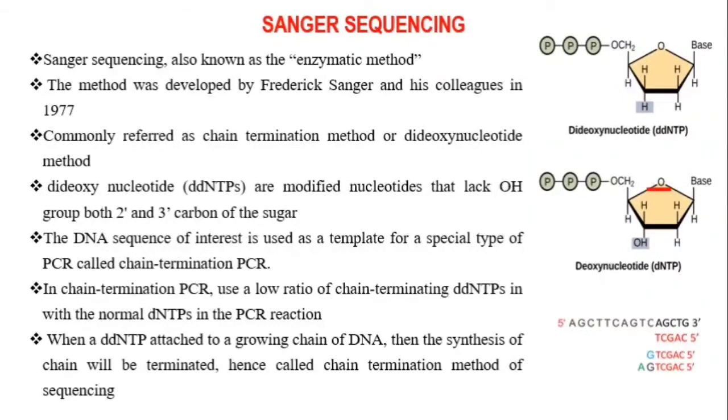Here you can see this is the dNTP, that means deoxynucleotide. This deoxynucleotide is present in normal DNA.